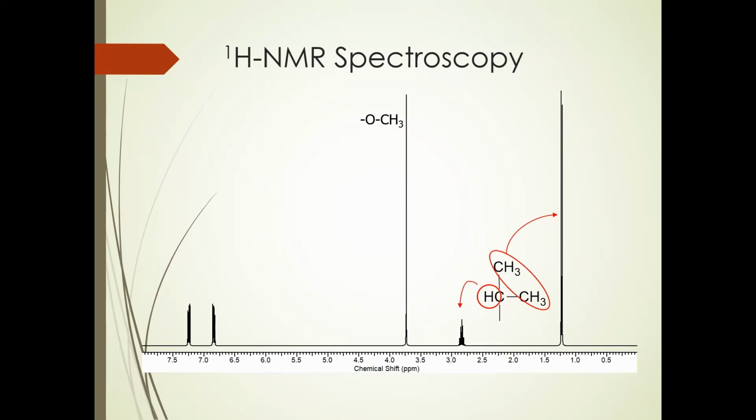So moving to the aromatic region, we have these 2 peaks. When we expand them, we can see there are 4 each of those sets. But 4 peaks, these are not quartets because it is not that 1-3-3-1 pattern, and it's also not evenly spaced. So this is something else. For those of you that have covered it in lecture, this would be what we call a doublet of doublets.